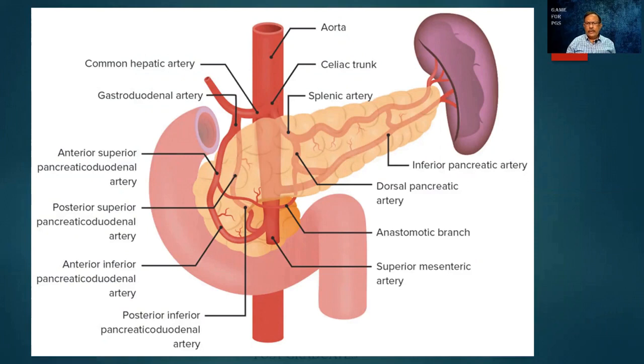A beauty of it is there is no abrupt conversion from the duodenum to the jejunum or to the ileum. In fact, sometimes when a slide is given to us, we have some amount of difficulty in localizing it as the ileum or the duodenum or the jejunum. Duodenum, of course, we'll have to look for the Brunner's glands. And these are all the blood vessels. Have an idea about these blood vessels. The pancreas sitting comfortably within the folds of the duodenum, and the tail ending in the spleen.